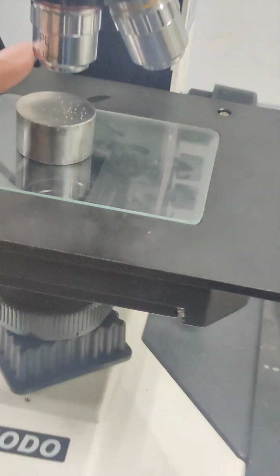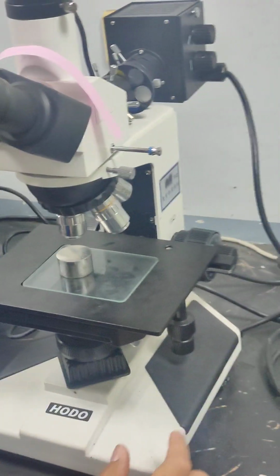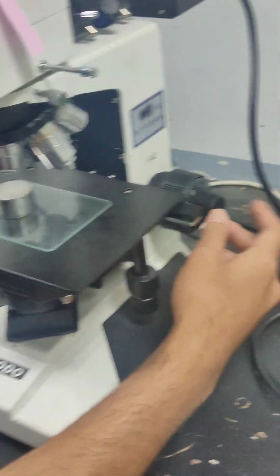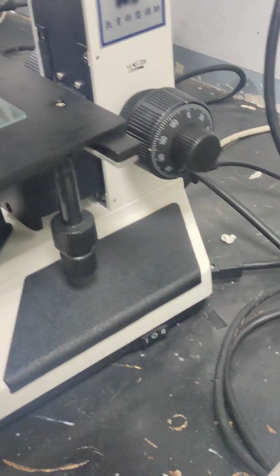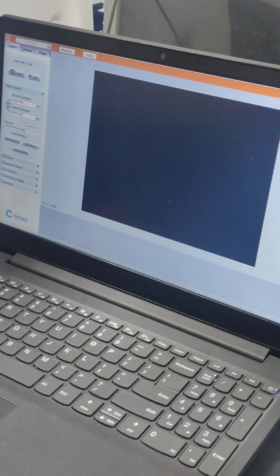And it's right here. We've chosen 5, which is on here. You've got to go this way. See it? Alright. Yeah, 5 times 10 magnification. And we have to adjust it. Let's increase the exposure of the light through the lens so we can see it clearly. I think you need to turn on the light. I haven't, no.